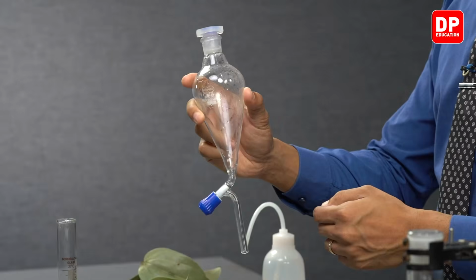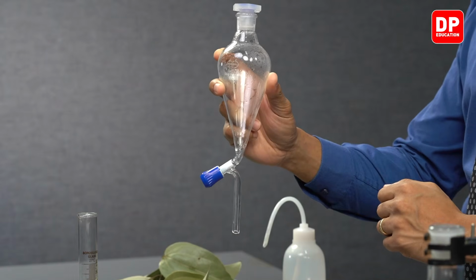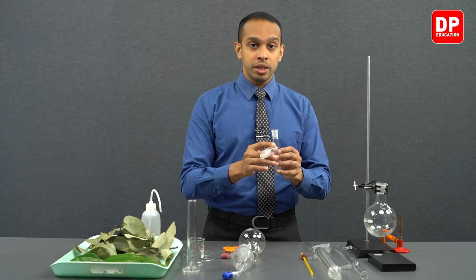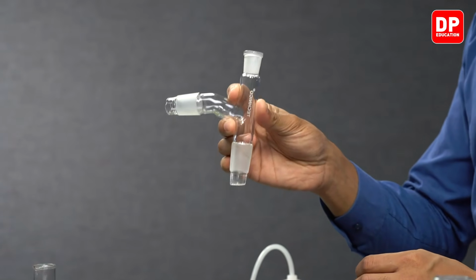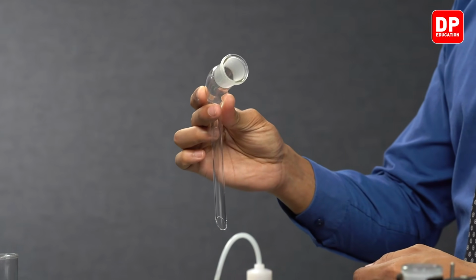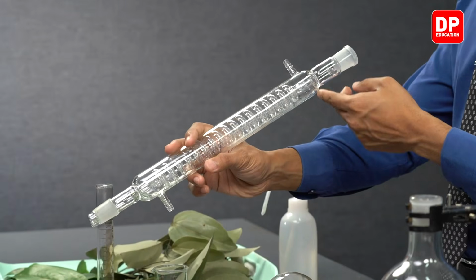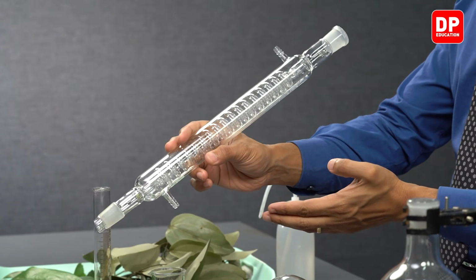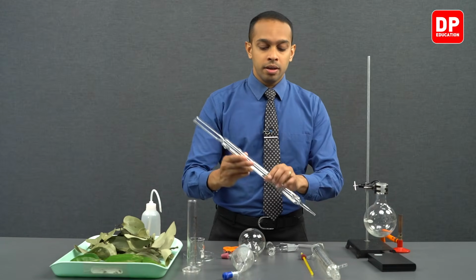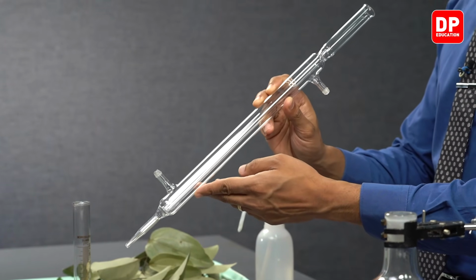We will be using a separatory funnel, also known as a separation funnel. We'll be using a three-way adapter, a bent distillation adapter. We'll be using this Graham condenser. This is a type of condenser known as the Graham condenser. We have a Liebig condenser here. We'll be using this also for our extraction process.